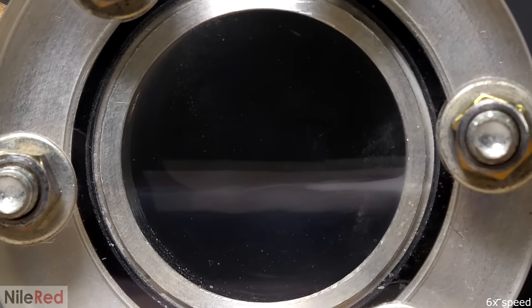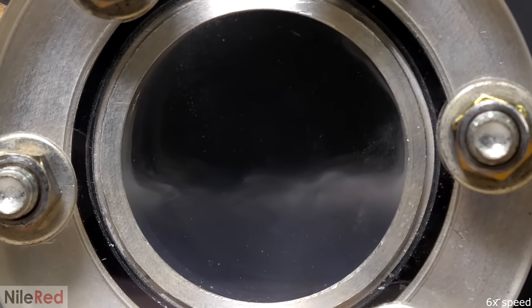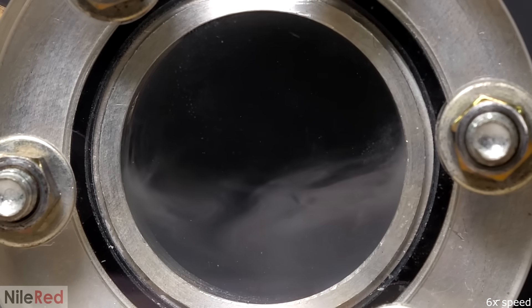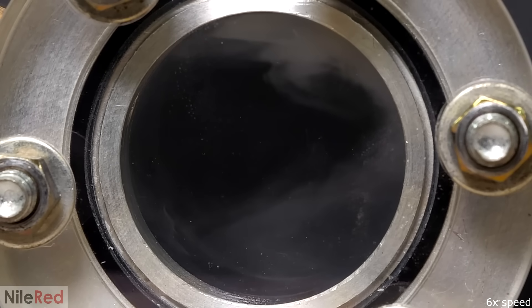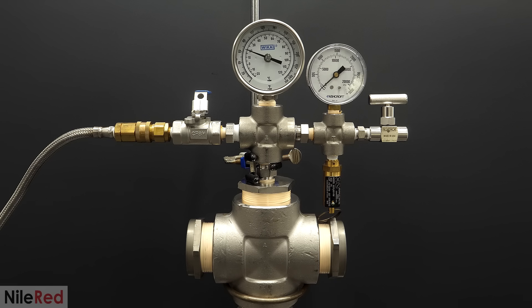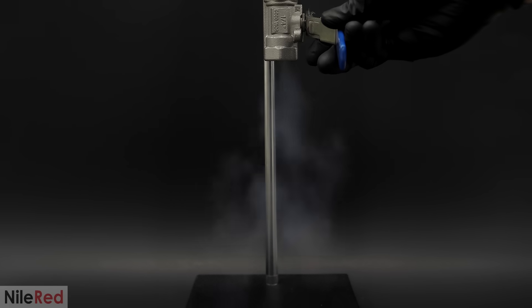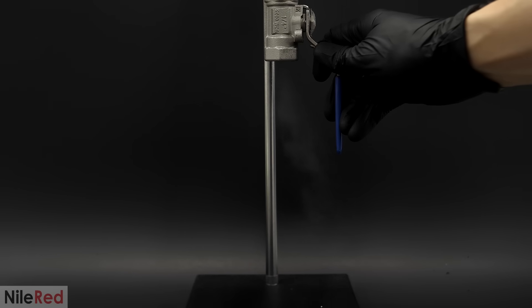The chamber worked super well and didn't blow up and kill me, so again a huge thanks to Ben for letting me use it. When I first started this project, I wanted to use the chamber to make aerogel and also to extract caffeine from coffee, but I found that neither would really work — both need much higher pressures and longer soak times, and the O-ring in this chamber just wouldn't handle it. To do either, I'd have to build a proper chamber using stainless steel and all high-pressure fittings. This video was filmed over 6 months ago, and in the meantime I actually did put together the proper chamber and used it to make aerogel — I'll eventually post a full video about it on my main channel Nile Red.